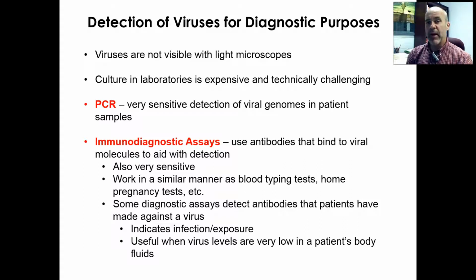And you might be wondering about those RNA viruses, because we said PCR amplifies DNA, but interestingly, that good old enzyme we learned about, reverse transcriptase, that HIV and its relatives use as part of their life cycles, can be used artificially to convert. If you have an RNA virus, its RNA genome can be converted over to DNA using that enzyme, and then you just run the standard PCR on it, so you can actually amplify RNA virus genomes as well.